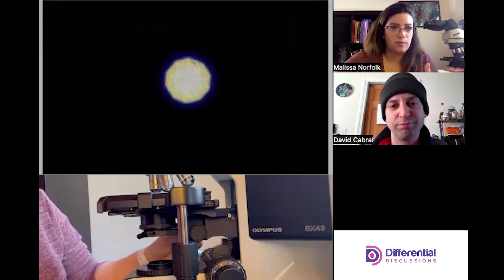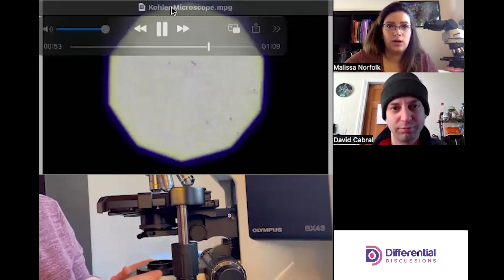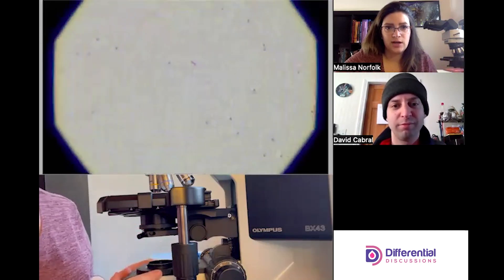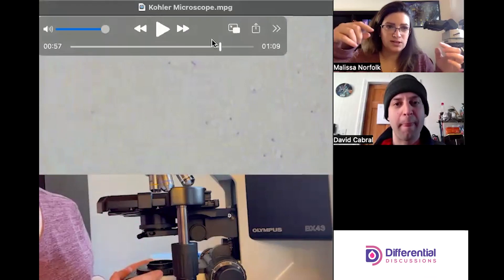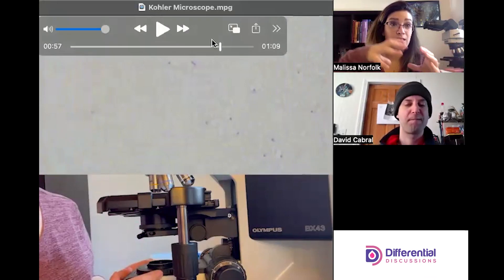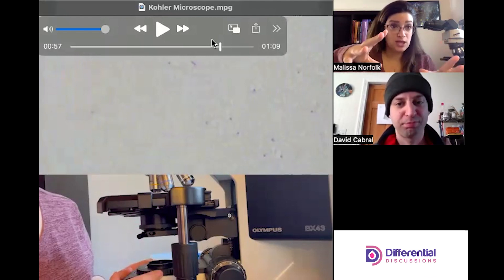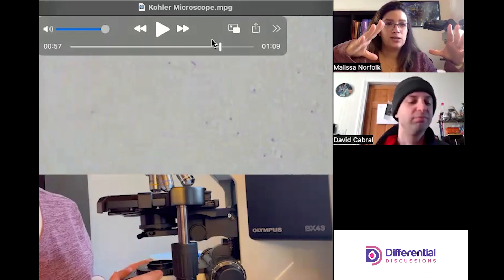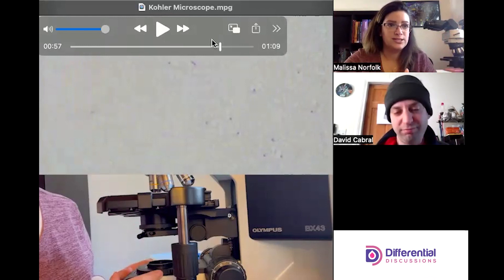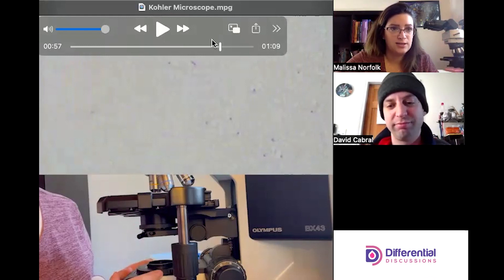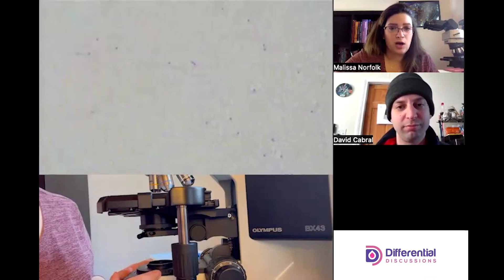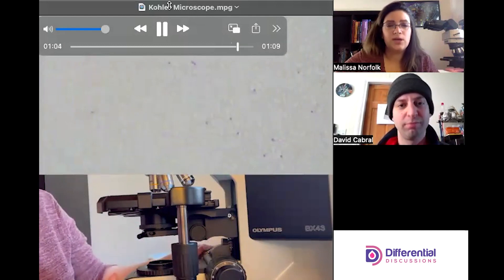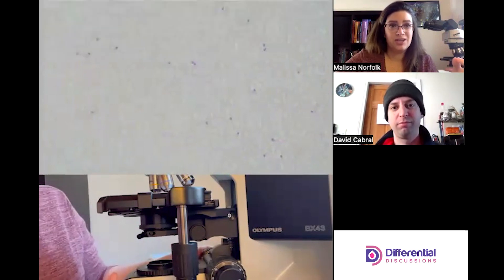Just making sure that it's in sharp focus, that geometric shape. Now I'm going to open it. As you open it, you want to make sure that you're going to bring it until it's just outside of your field of view and you can almost still see the corners. You want to do that to make sure that your light is actually centered, because if you think you've centered it but then you open it up and you have more of—well this half is out and this half you can actually see the edges—then you need to redo the Kohler and move them further into the center when you have that geometric shape at its smallest size. This may take you a couple of times to get it perfect, but again it's worth it because it's going to give you the best quality image.